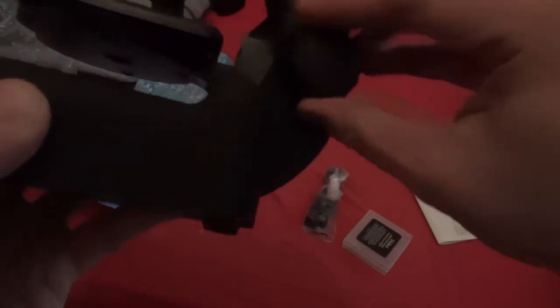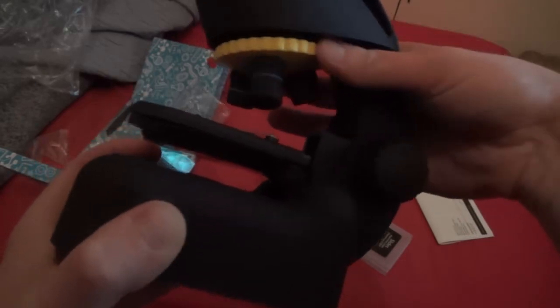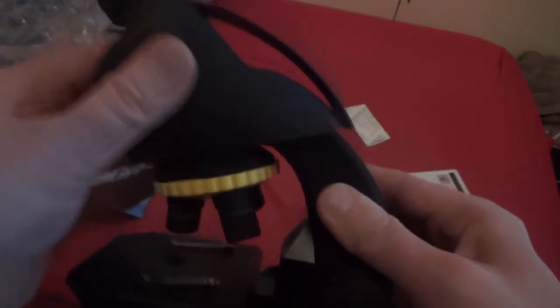So let's actually open this up and have a look at our little microscope. Here is our microscope — I think you can actually lower it here, like that. This one has two different magnifications right there and it has a really nice rubber feel. I quite like that. This is obviously the eyepiece, and I think this might be the focus mechanism here.